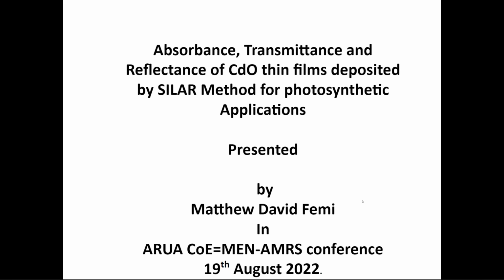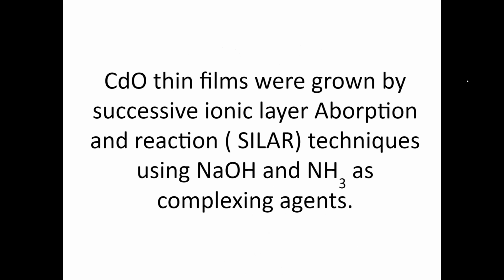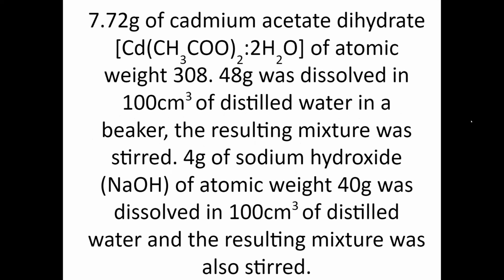And then for cadmium oxide, there are various experimental methods used in depositing it. We tried CBD, but CBD was not giving us a good deposition. We tried spray pyrolysis. It wasn't giving us a good deposition. That is why the SILAR method was chosen to deposit the thin film.